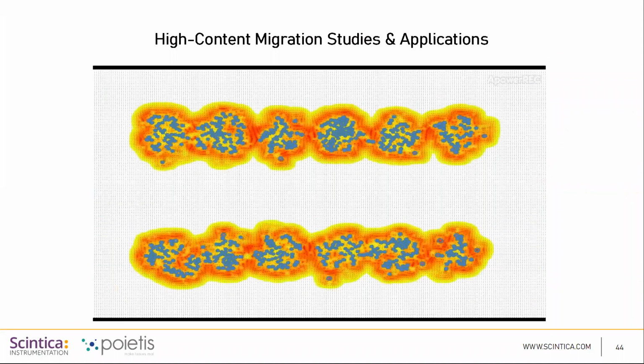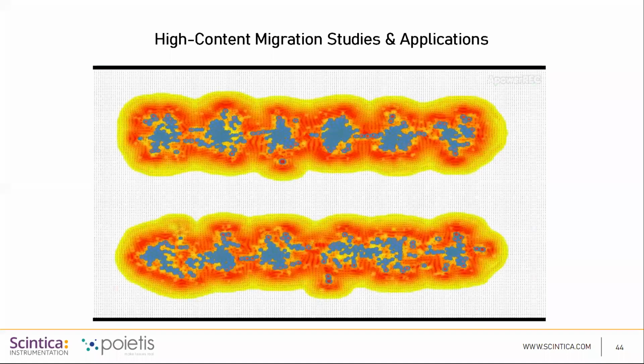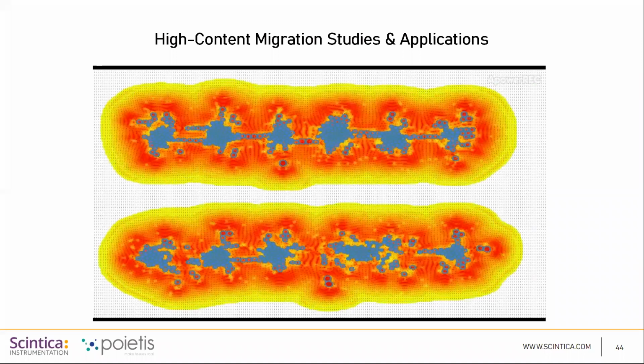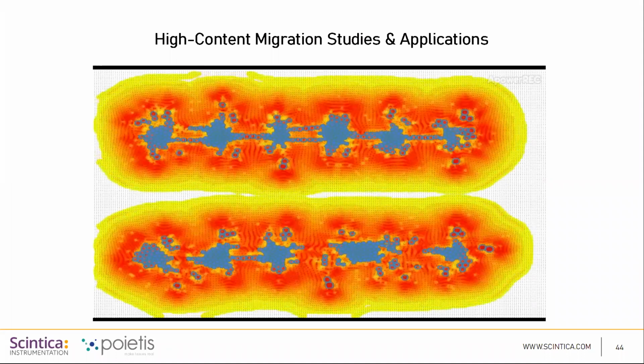The software then ran and used a different algorithm developed to model migration events of cells and interactions with the matrix. It's what you see now. And the more the matrix is remodeled, the more it tends toward red. In the end, we can compare the results of this modeling to what actually happened in vitro.